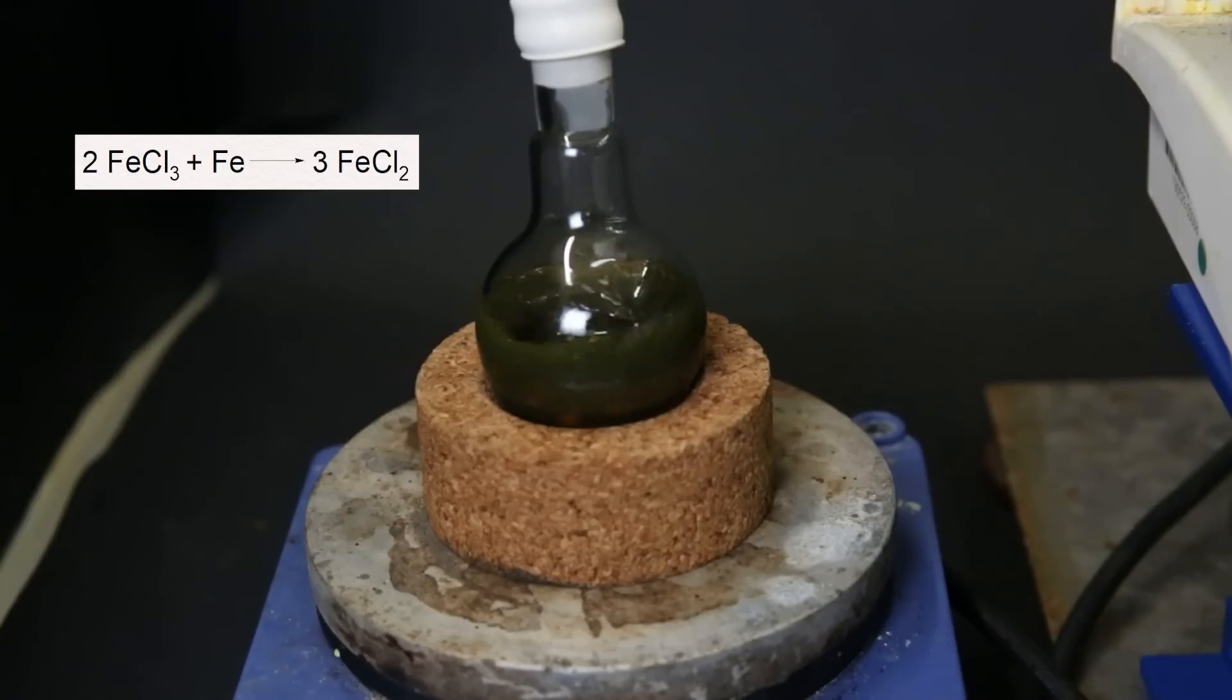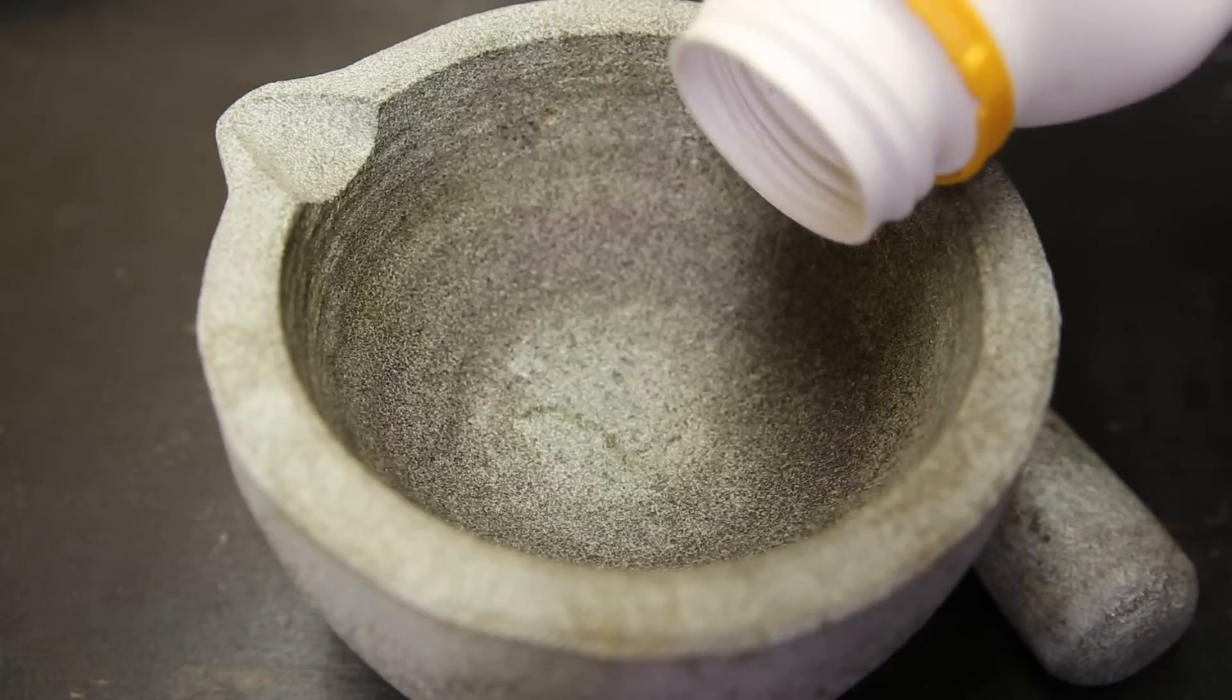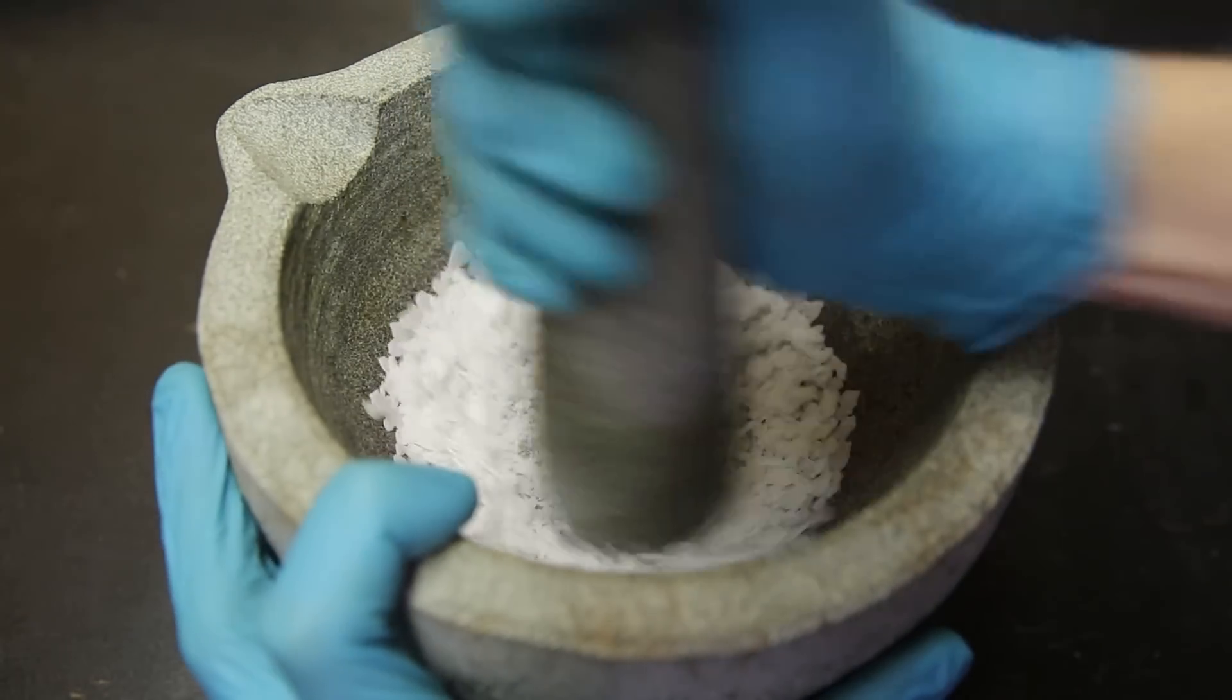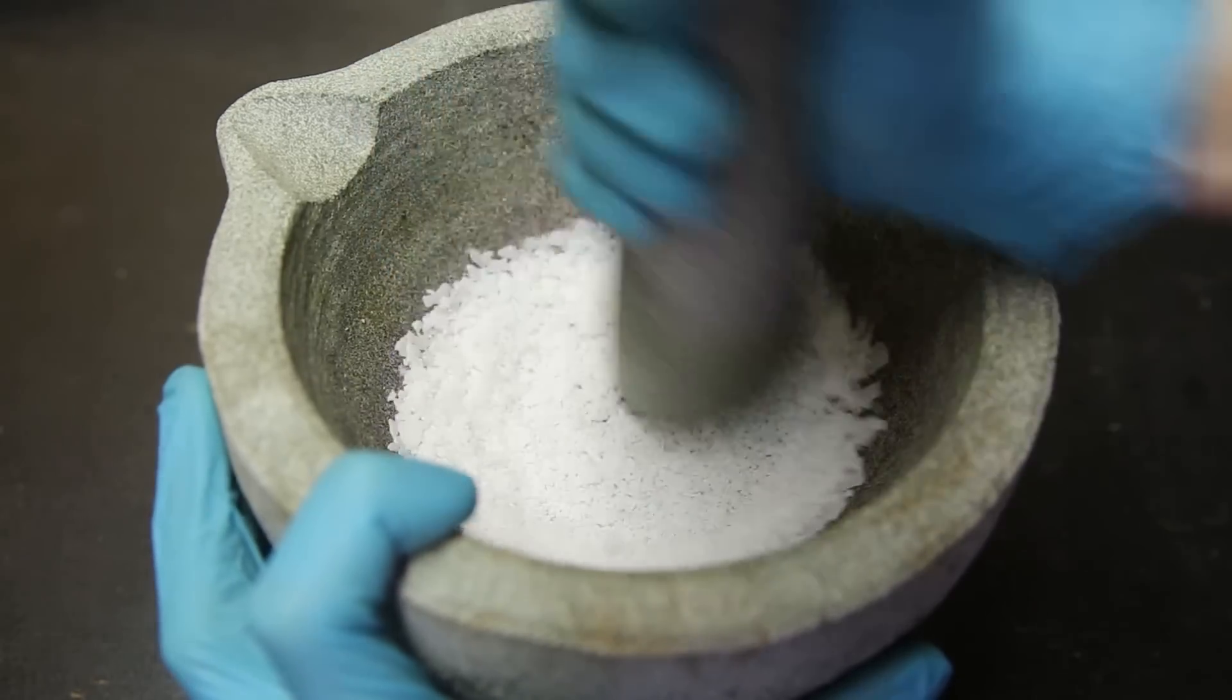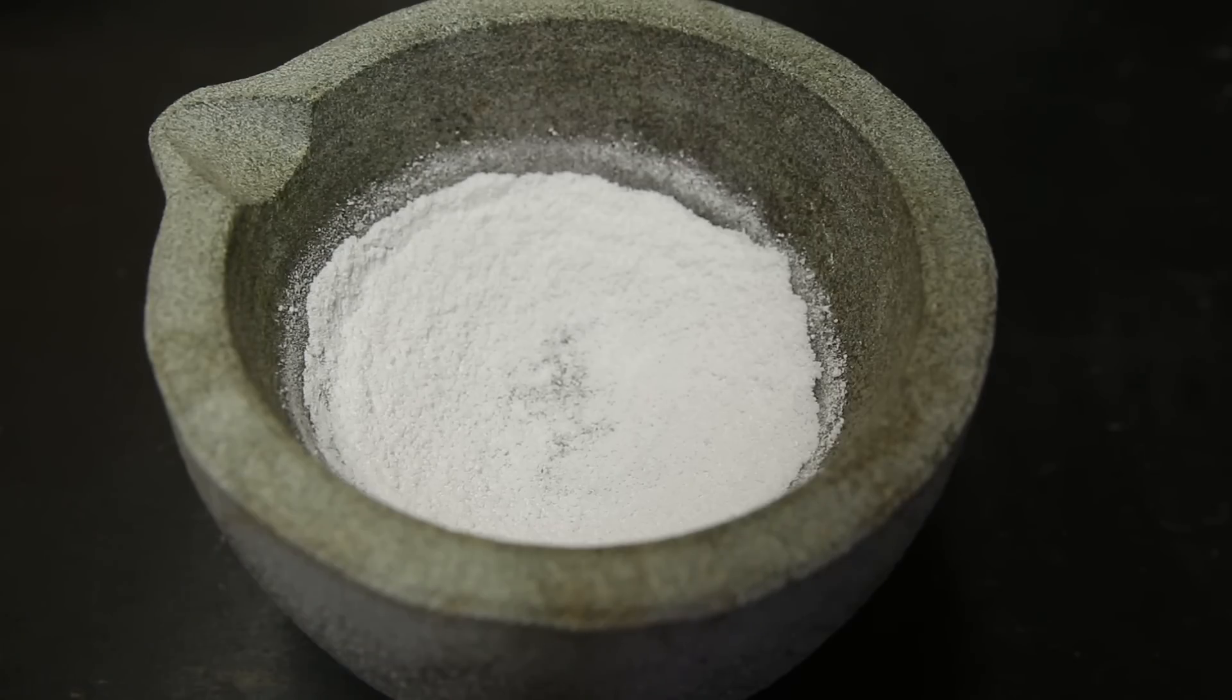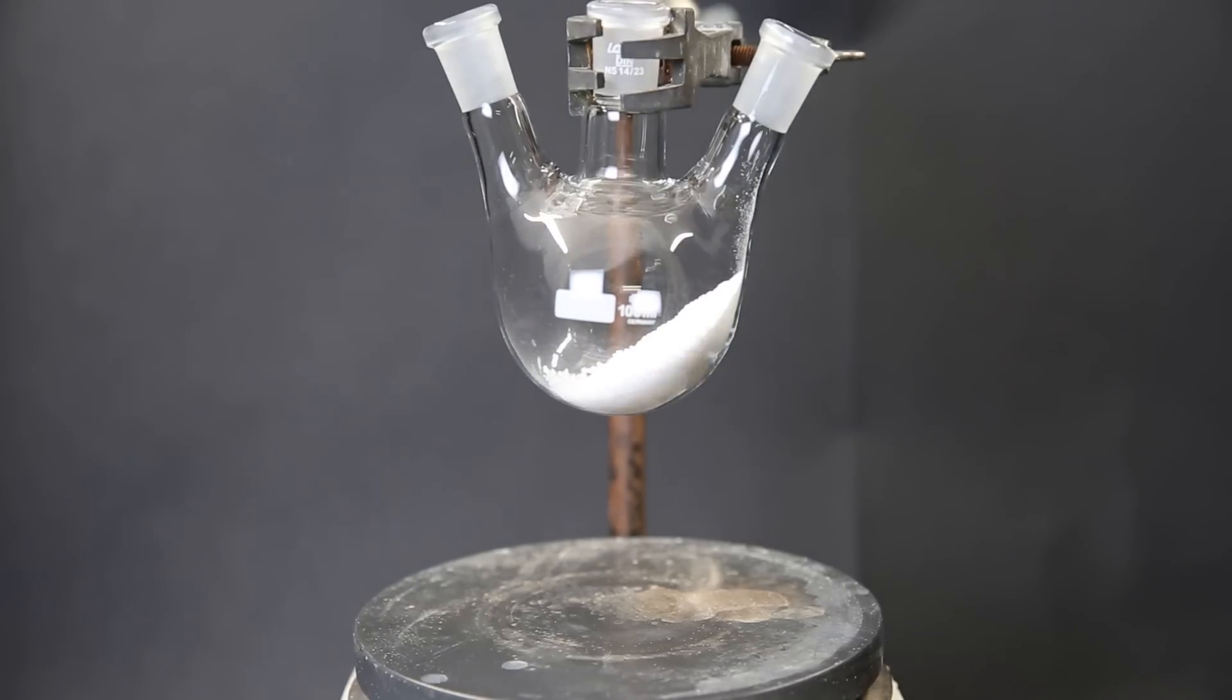So now I just leave it to stir for a while and start the next step. To get a slightly better yield, I grind up some potassium hydroxide into a fine powder to increase its surface area. Then I add 20 grams of the powder to a flask and drop in a stir bar.